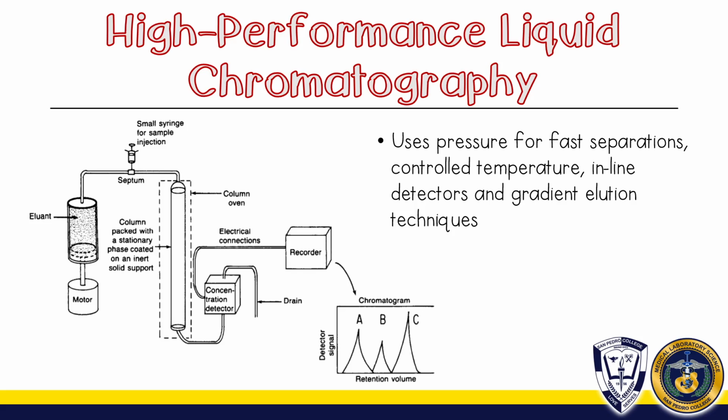And to further discuss how HPLC works, since I have discussed the basic components one by one, kindly watch this video first.